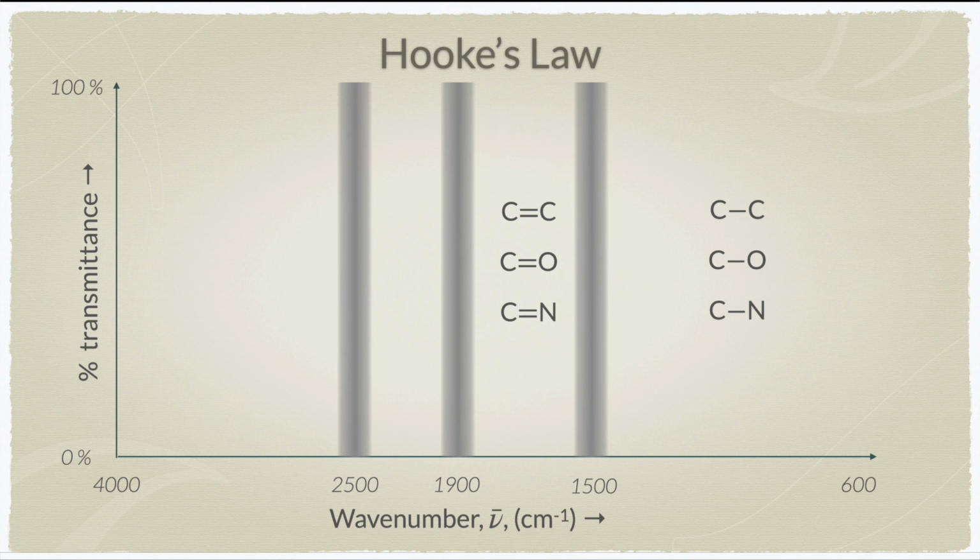Of course, just like I told you, this is not a rigid region. Sometimes it might overlap to this side, sometimes to that side. So it's not always fixed, but to some extent they are mostly in this region. Then the third one is triple bonds here: carbon-carbon triple bonds, carbon-nitrogen triple bonds.